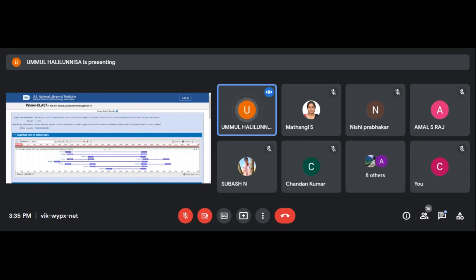Okay. While generating your reverse primer, what do you have to do? Either you have to go 3' end to 5' end, or you have to complement it. Which way is better? Divya, can you answer? Yes, ma'am. We write from 5' to 3' and then we complement it. From 5' to 3' for which region? Forward or reverse? Ma'am, for both. Okay. Then we complement it.